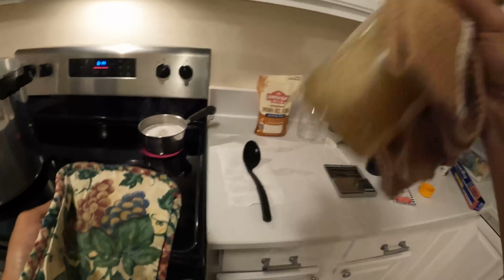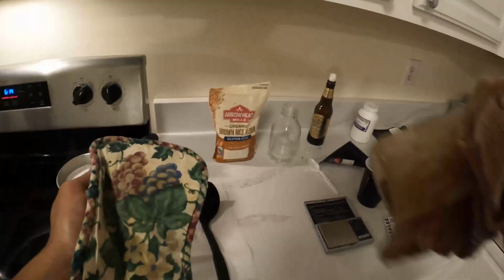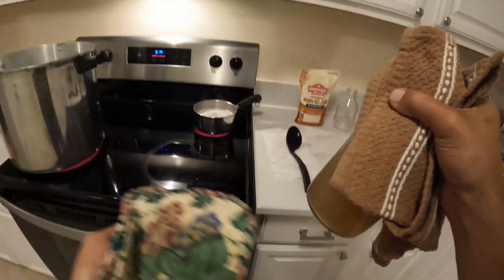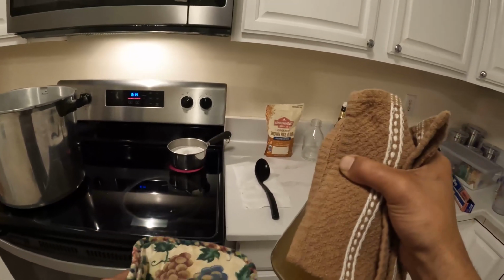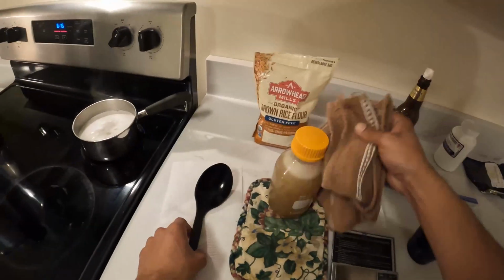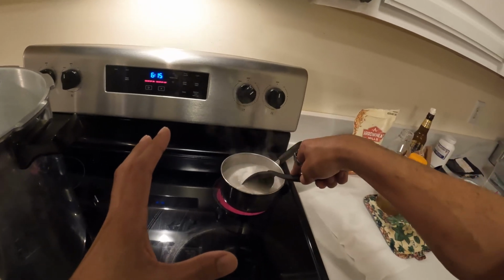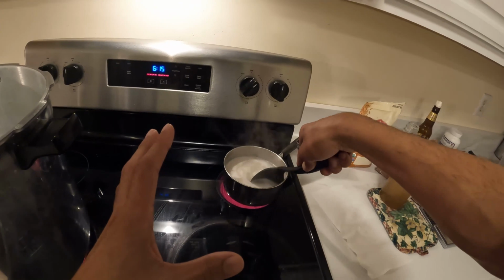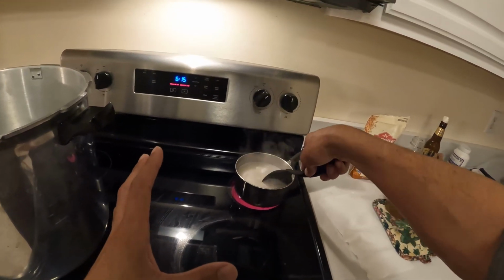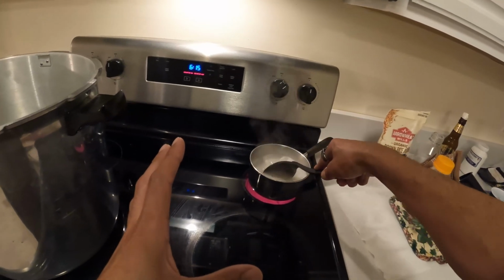So learning how to work with spore prints is ideal, because on the agar you can see the contamination. You can cut off away from the contamination and put it onto a new plate. And also, say you're outside and you find a mushroom that's growing on wood, like lion's mane for an example. We already know that lion's mane is easy to cultivate indoors, or oysters. So you can clone that tissue sample out of that mycelium on the petri dish and start to regrow it yourself. And it's cool because we need to keep the wild strains in the mix. We don't want them to get too domesticated. It's good if we have some domestication in some aspects, as far as if we're looking for particular characteristics, but we always have to go back to nature and gather again new.